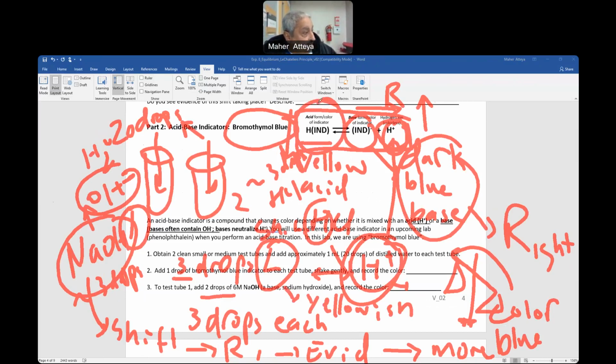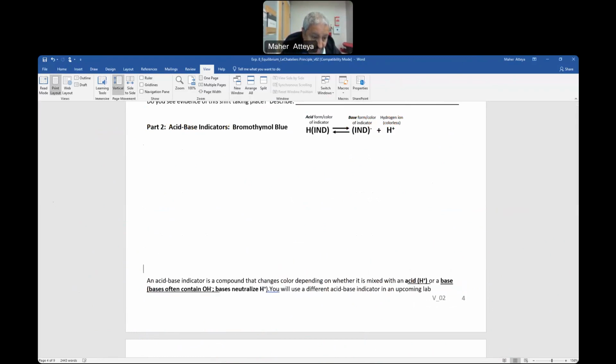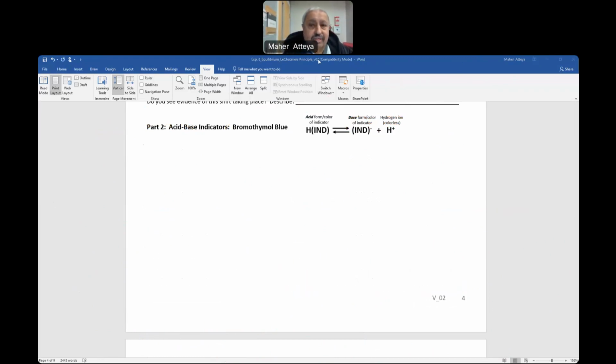Okay, guys. Now, the one that has HCl, can I take this one out? Okay, I'm taking this one out, and look. The first one, number one, I added sodium hydroxide, correct?